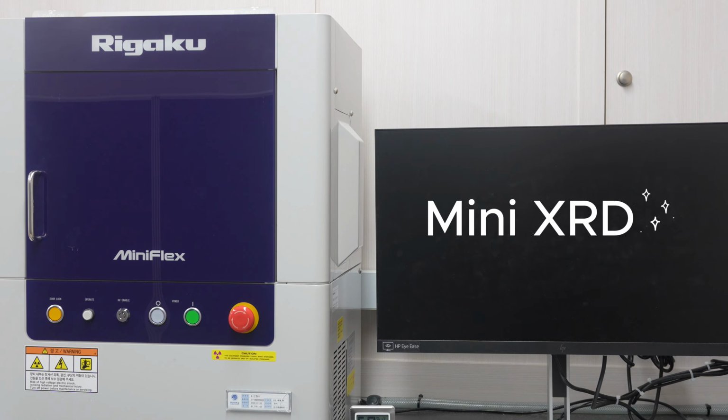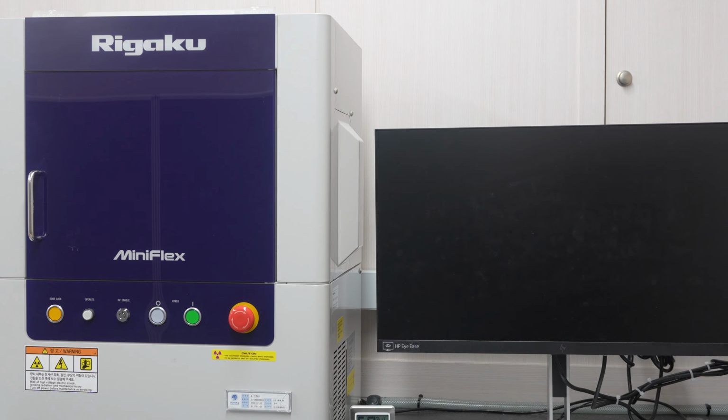In this video, we are going to explore the fascinating world of X-ray diffraction, a powerful technique used to analyze the crystalline structure of materials. So whether you are a student, researcher, or simply curious about how we understand material properties at the atomic level, this video will guide you through the basics of XRD, how it works, and its application in various fields. So let's go!